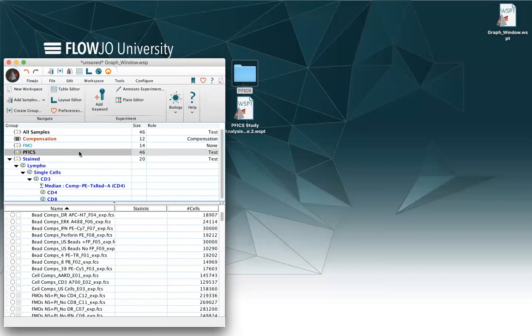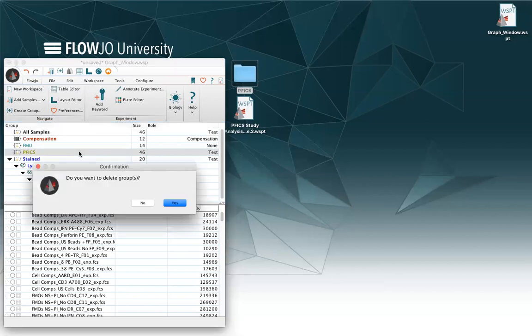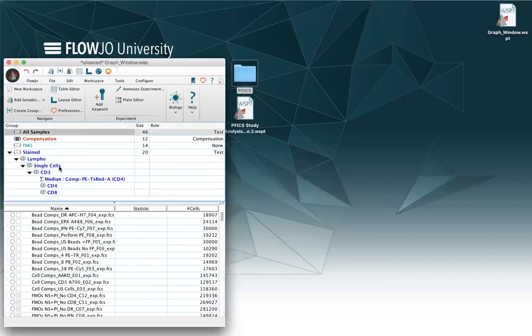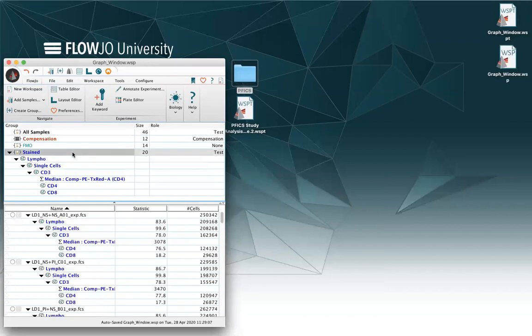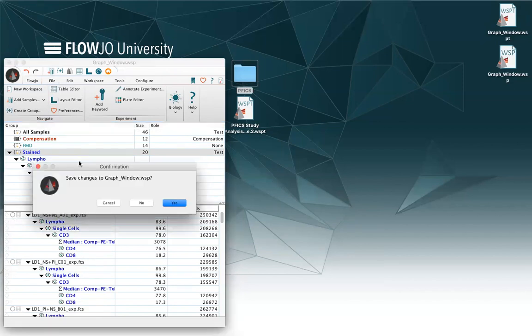For group properties tool, please watch the video on groups. I can also delete this group and go back to my actual workspace.